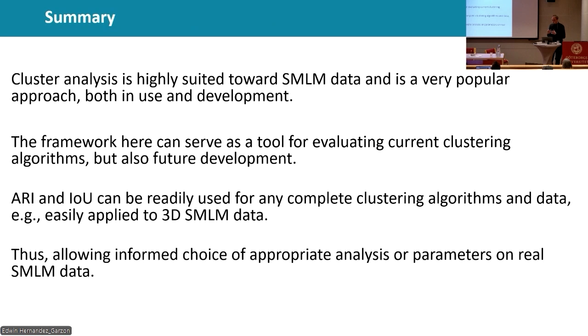So in the end, cluster analysis is highly suited to single molecule localization data, a very popular approach. And this framework is really here to help with the assessment of new tools. But again, you can try to use it to get at least a first view of what you could use as parameters in your biological data if you have something that is similar to the simulation. Obviously, if it's not the case, you're back to the drawing board and trying some parameters. And in this case, maybe DBSCAN is not the perfect one, because with parameters, when you don't really know what you're doing, it's complicated.